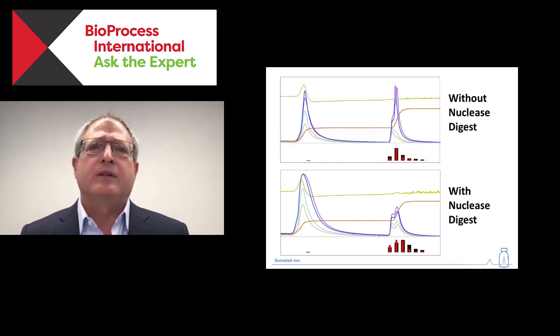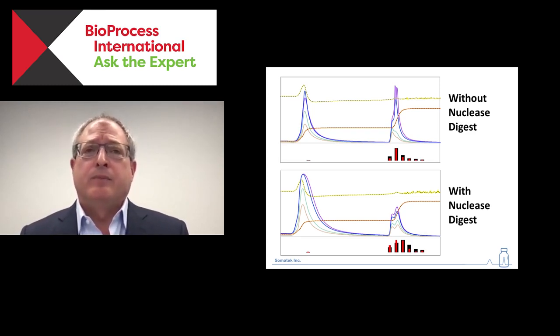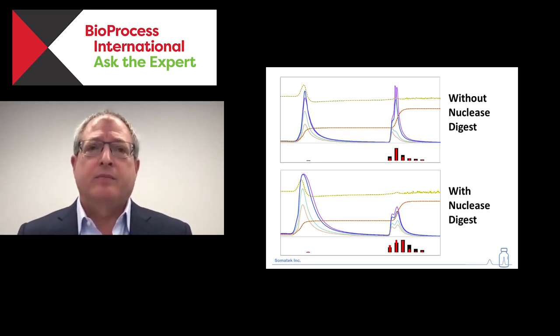If we take a look at the two chromatograms side by side, it's pretty evident. The endonuclease digest basically lowers the molecular weight of your chromatin, and all of these UV absorbing species move to the left. Our product peak gets smaller, but our product is still present and therefore more pure. So there were a number of other assays that we were doing at the time. It actually turned out our product was quite impure at this point.